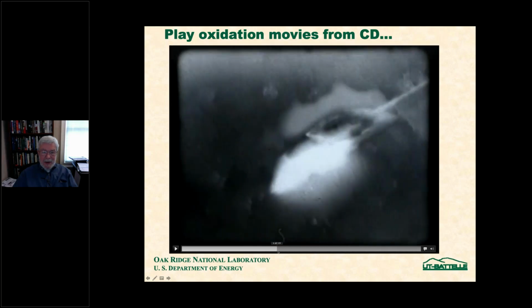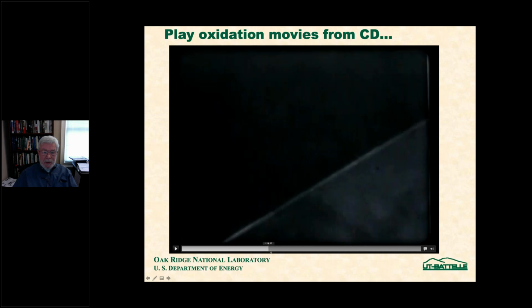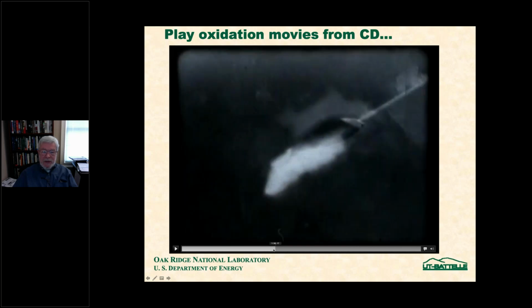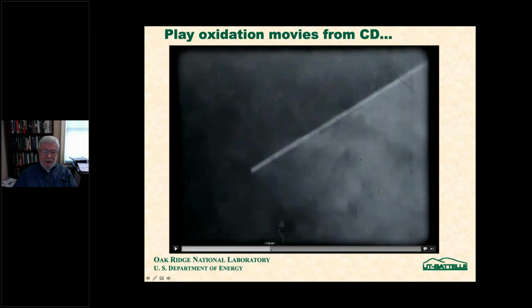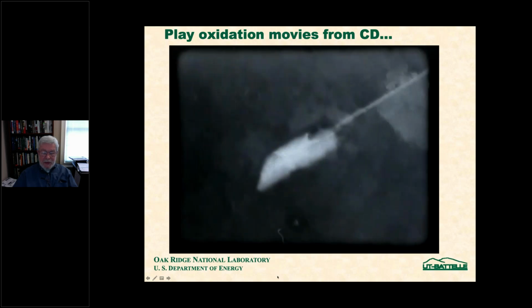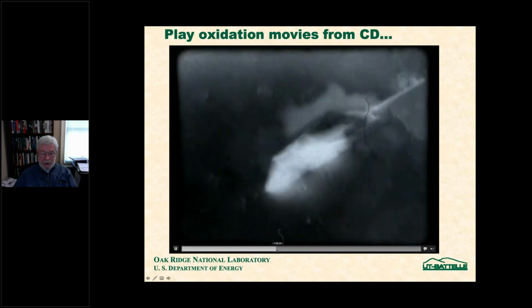Okay, and here's another one. That grain growing along there, we calculated to be about as fast as grass grows. And this is kind of the lifetime on that. So that's about as fast as grass grows. There are no mag markers on the films, of course.